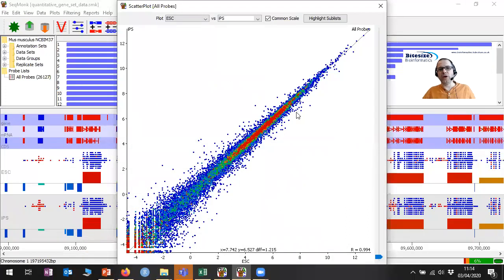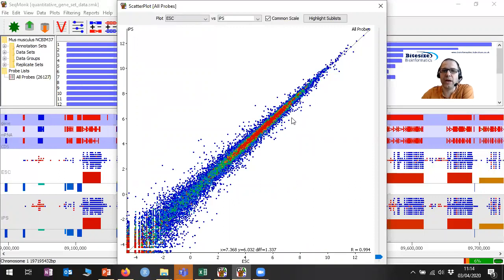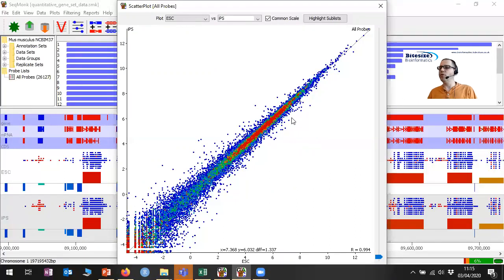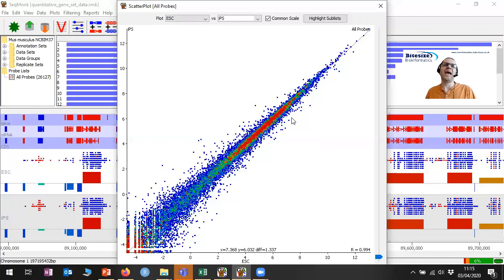The other component we need is a set of genes to test — in fact, lots of sets of genes. We need some kind of data source that gives us a functional set: something with an actual meaning like a pathway name, a molecular function, or a biological process, with a set of gene names associated. There are lots of databases that collate these types of sets. Obvious ones include the gene ontology, which is very big, and pathway databases like Reactome or KEGG and lots of other sources.